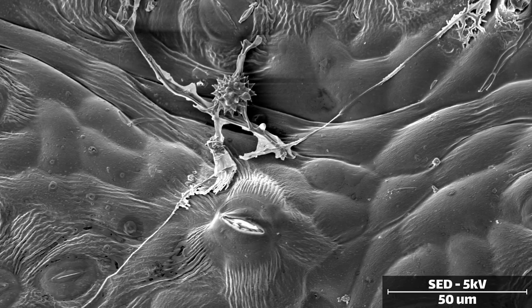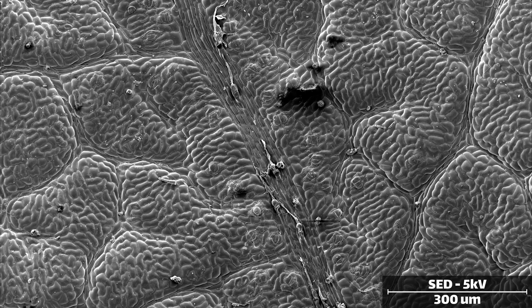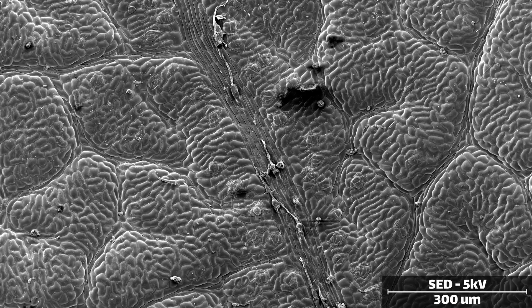Running through the epidermis, we see veins. These carry water and nutrients from the roots up to the leaves, and transport sugars from the leaves back down to the roots.